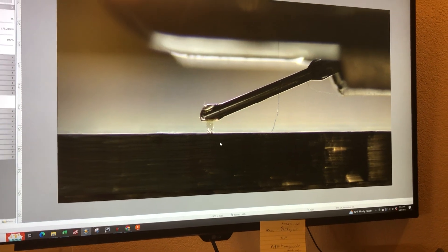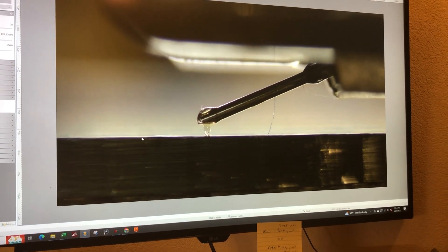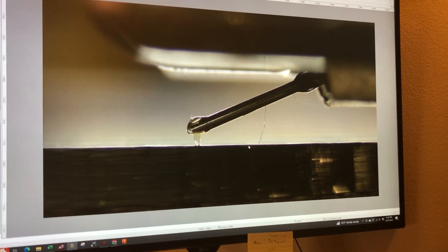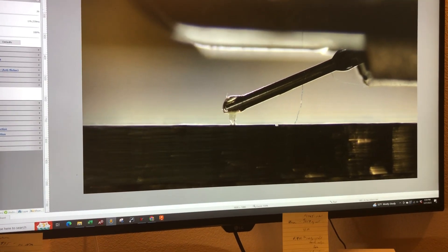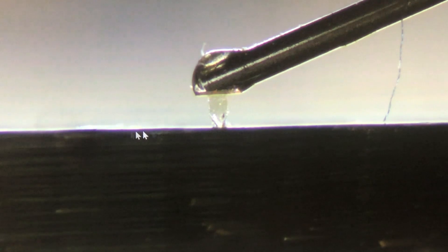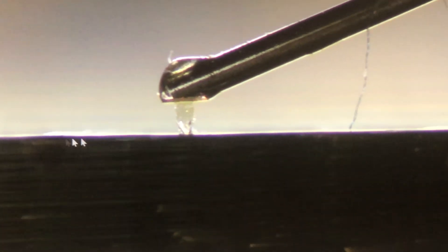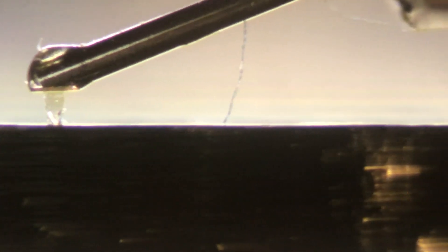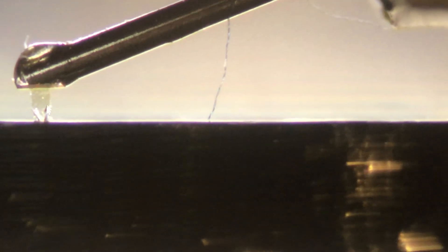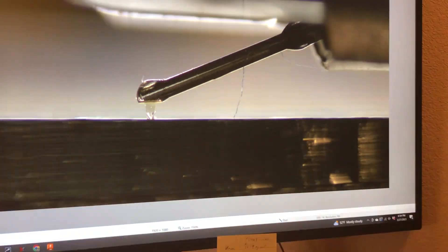Keep an eye out for white flashing along the bottom here. If the white flash gets too hot that's overexposure and it will make it more difficult to draw a line on there.